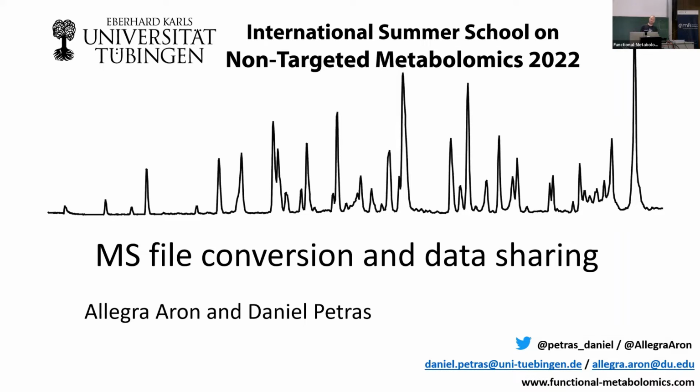So the first steps that we have to do now, after the machine has acquired the data, would typically be some sort of sanity check. We want to see, okay, was there some useful information acquired? And then we need to convert these files, so do the centroiding and then conversion to an open access format. In our case, we're going to use mzML.